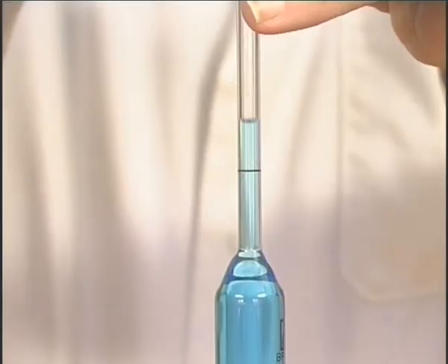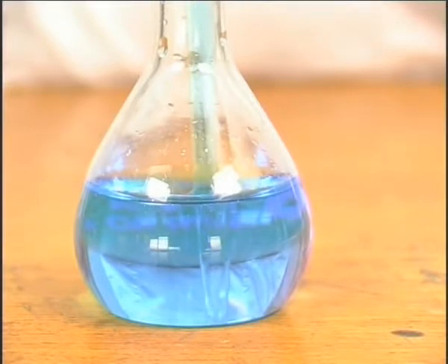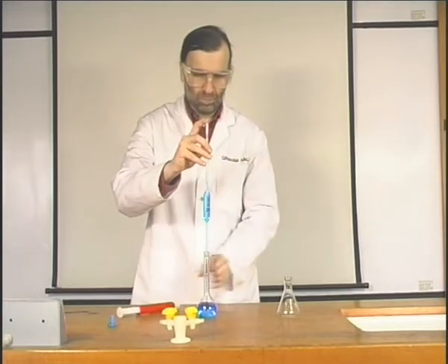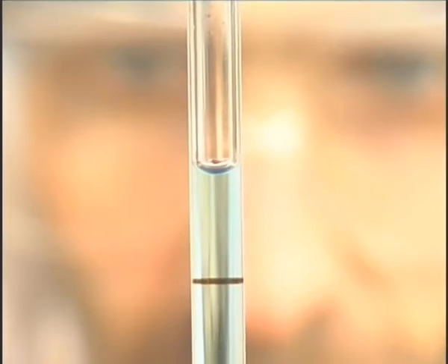When the liquid is a couple of centimeters above the mark, the tip is allowed to rest on the base of the flask. The filler is removed and the forefinger is placed firmly over the top of the pipette to prevent the liquid from escaping.